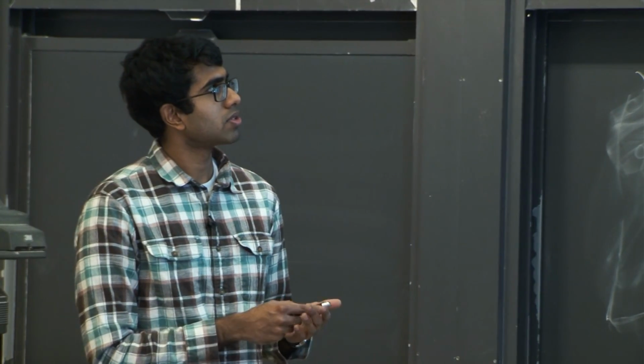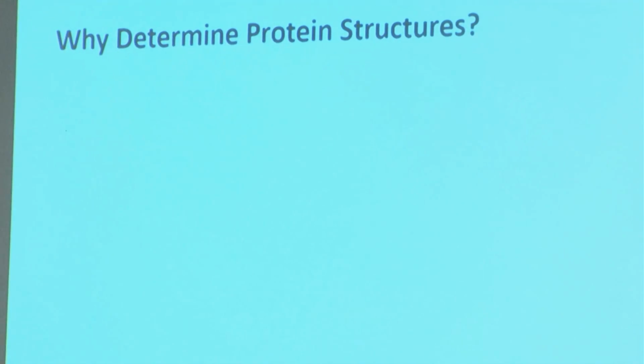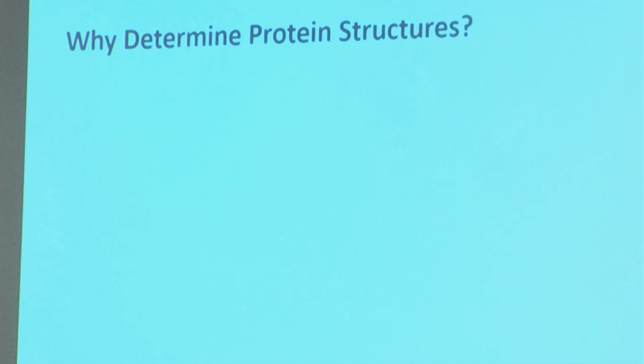And so just to go as an overview, today we're going to be talking about different techniques that are used to determine protein structure. And we'll be talking a little bit about the Protein Data Bank, or the PDB. And then the latter half of the recitation, we'll be doing a worksheet to look at the structure of ubiquitin and di-ubiquitin using PyMOL. So that's just to get you familiar with using PyMOL.